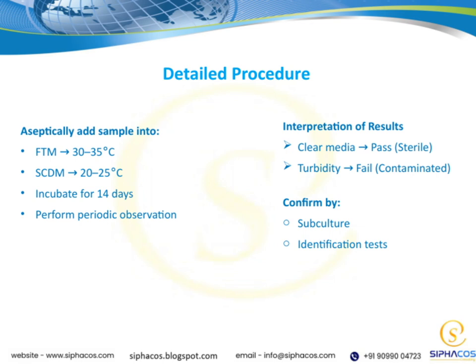Monitoring these cultures regularly allows us to detect any microbial growth early and ensure the accuracy of our sterility testing. This process is critical because it helps us confirm the initial visual assessment and ensures the reliability of our results in maintaining product safety and quality.